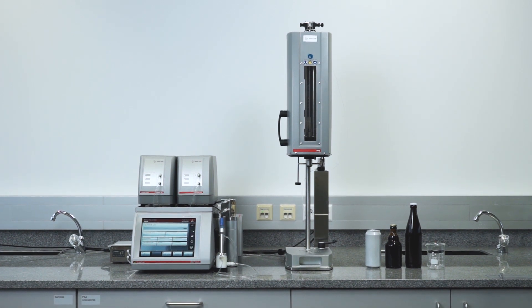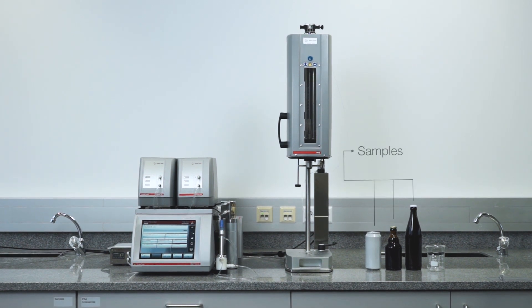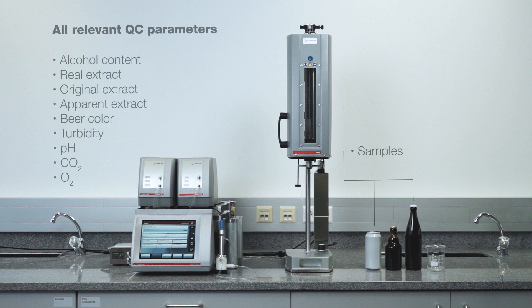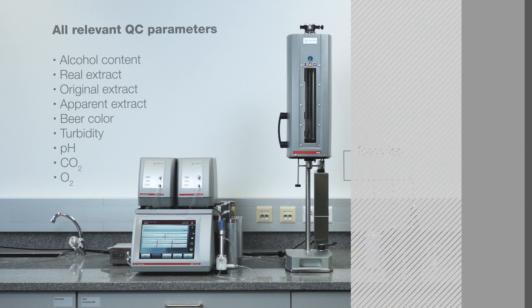PBA-B is in use for the analysis of all types of beers including beer mixed drinks, low and non-alcoholic beer, and provides all relevant QC parameters. As no sample preparation is required, PBA-B is the ideal solution for quick and accurate analysis in packaged beer.